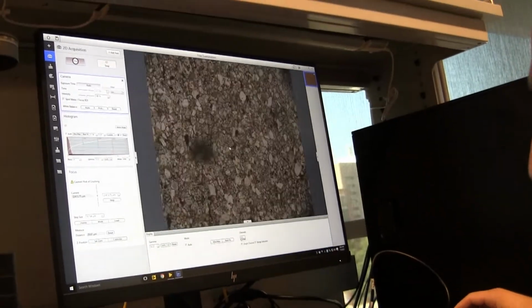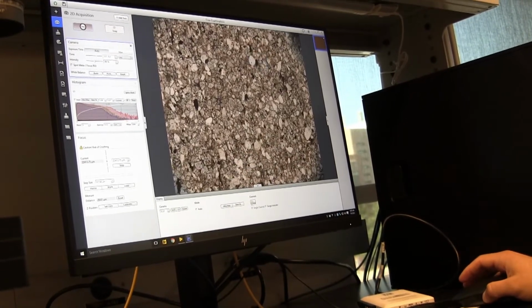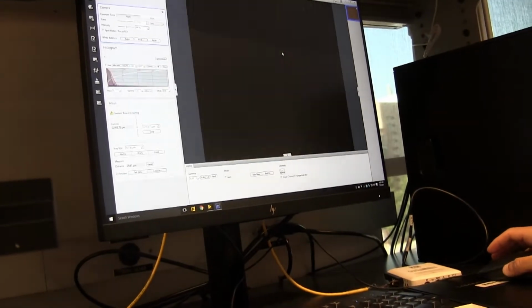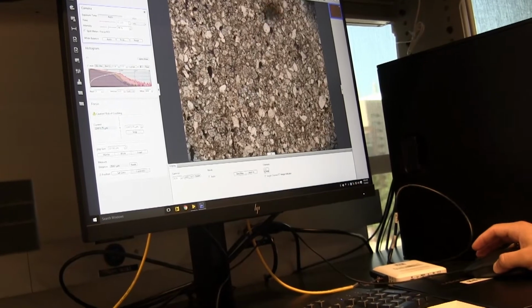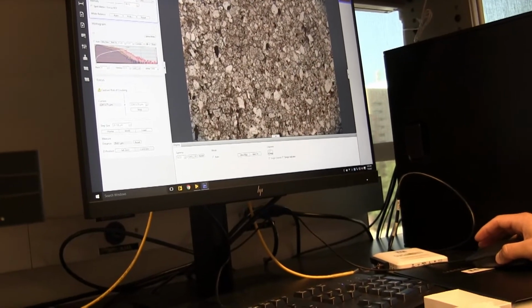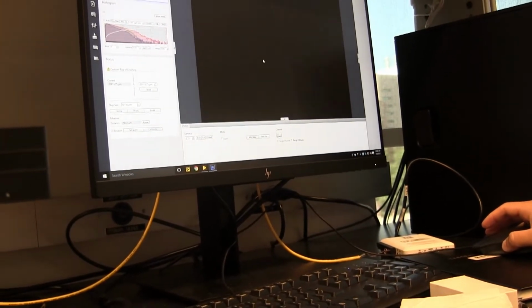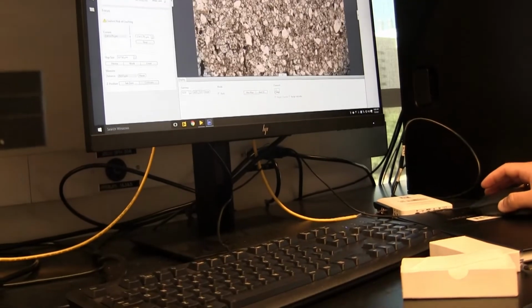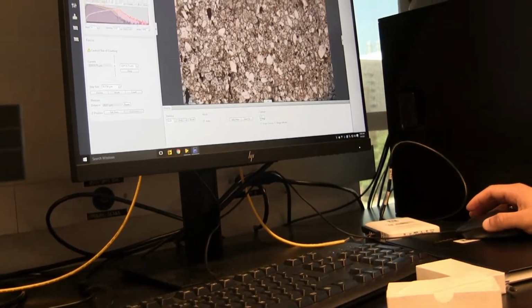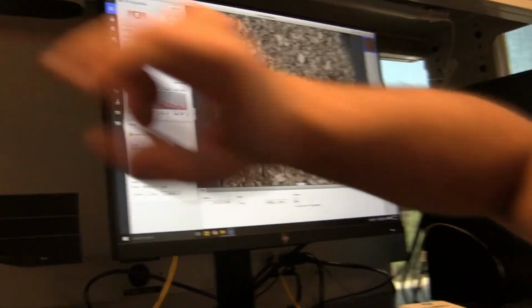Focus. The polarizer in. I think the polarizer probably has some dust. This is why you keep seeing those spots. Okay, let's keep it out. And let's go back to second mode.